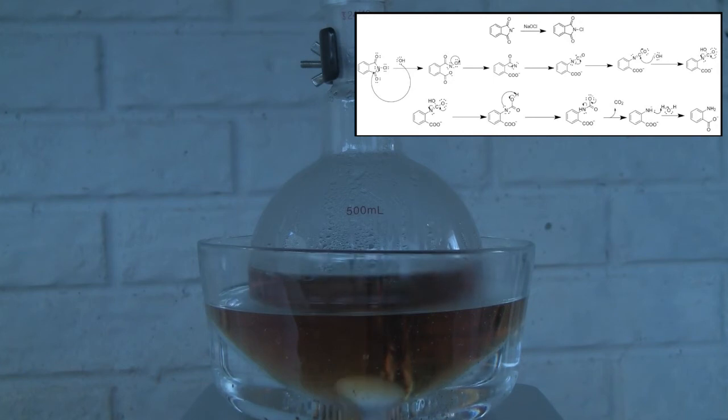In the basic conditions, a lone pair from the hydroxide ion attacks the carbon of the carbonyl and breaks the bond between the nitrogen and the carbon, forming the carboxylate of the anthranilic acid.